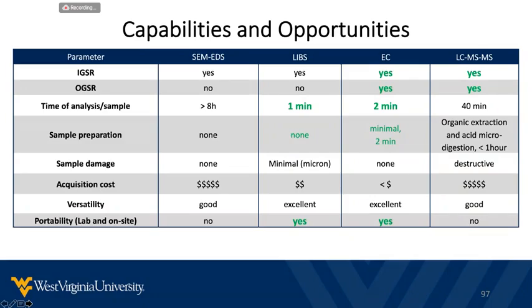LC-MS offers an appealing confirmatory method for organic and inorganic gunshot residues with low limits of detection and a relatively fast protocol. So I think the take-home message that we want to stress today is that together, these methods provide means to modernize the analysis and interpretation of gunshot residues and help overcome challenges of modern ammunition and GSR investigations.